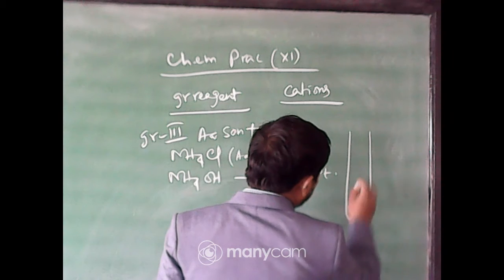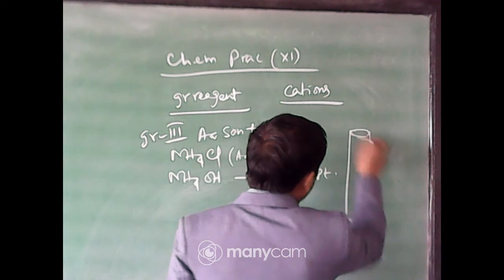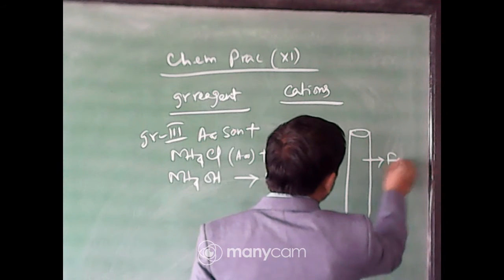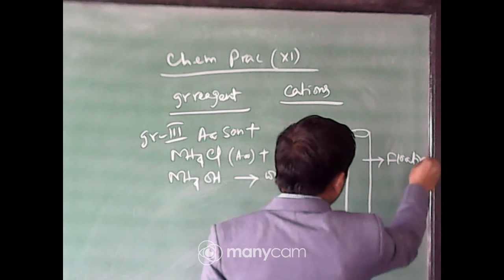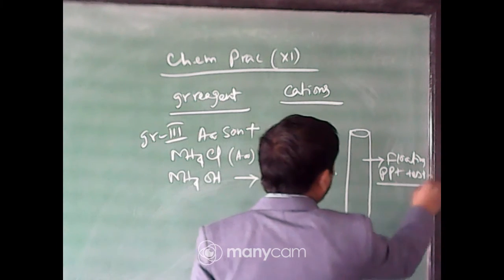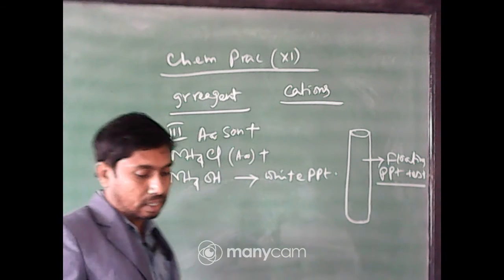So, for this reason it is called the floating PPT test. What is it called? It is the floating PPT test. Okay, so we will look at that test and then we will discuss the theory.